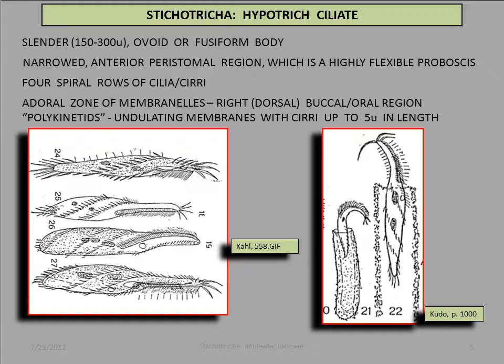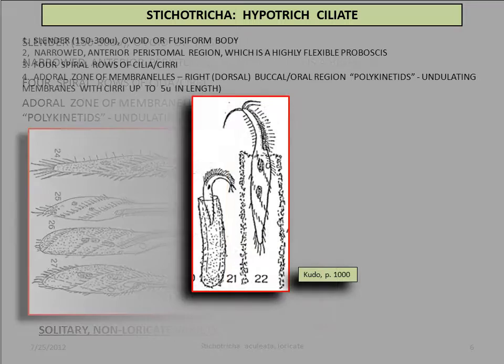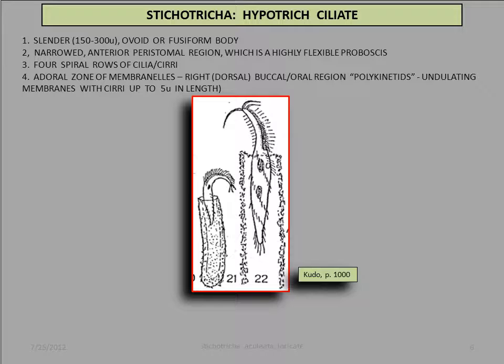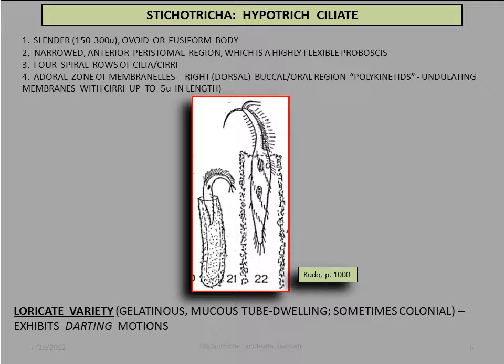Stichotrica may be found free-swimming in the environment in a solitary, non-loricate form, but is more typically found in a loricate form. The lorica is a tubular structure formed from gelatinous mucoid material secreted by the organism itself.